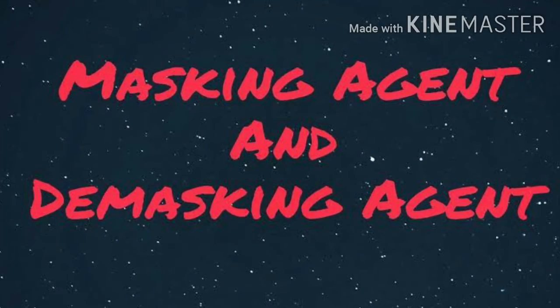Let's see what are masking and demasking agents. A masking agent is used to mask the impurities present in the analyzed solution. For example, if you want to analyze the calcium ion in any solution, and in the same solution magnesium ions are also present, then in that case magnesium ions are required to be masked. Otherwise we will not be able to get the exact concentration of calcium ions.